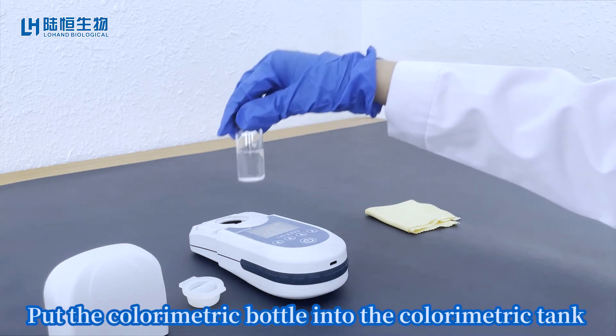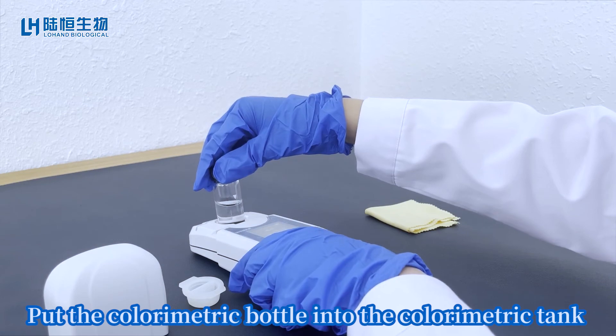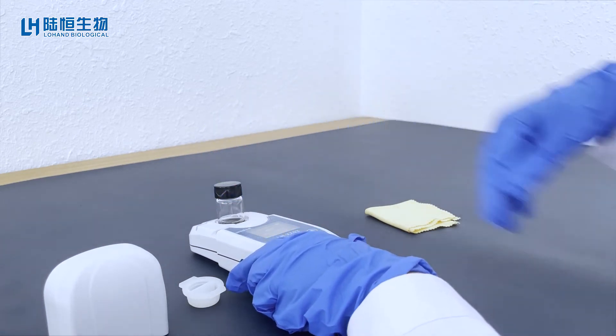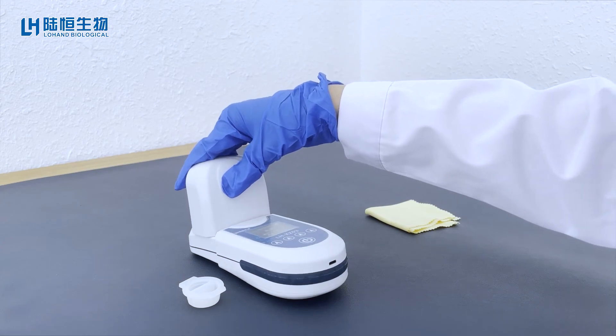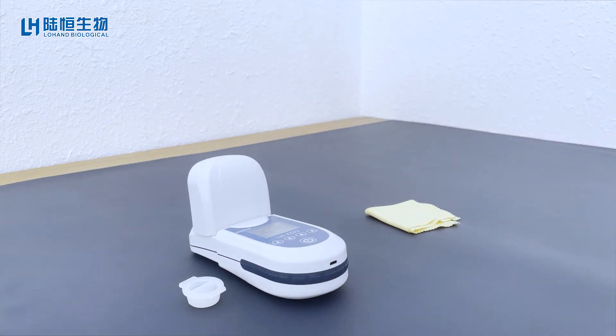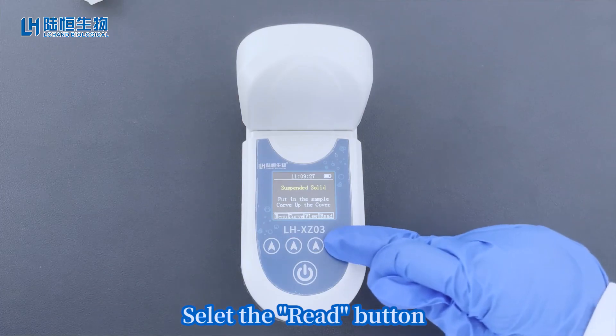Put the colorimetric bottle into the colorimetric tank. Cover the shading cover. Select the read button.